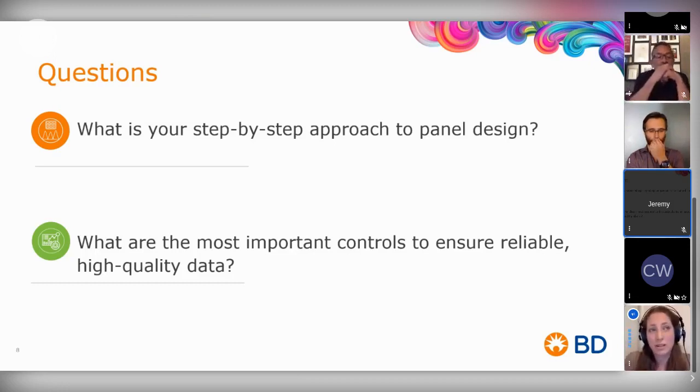So I've seen cases where the isotype staining gave more of a background than the antibody that you're using. So just be very cautious with those, and again, don't use those for setting your gates.